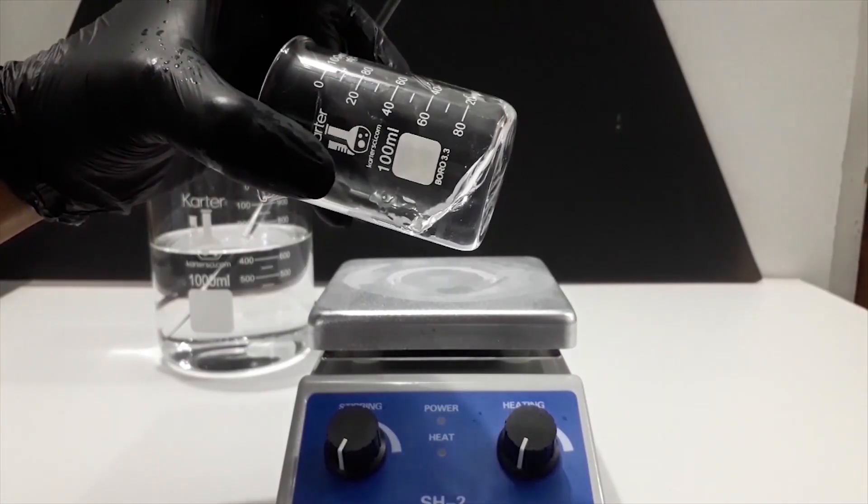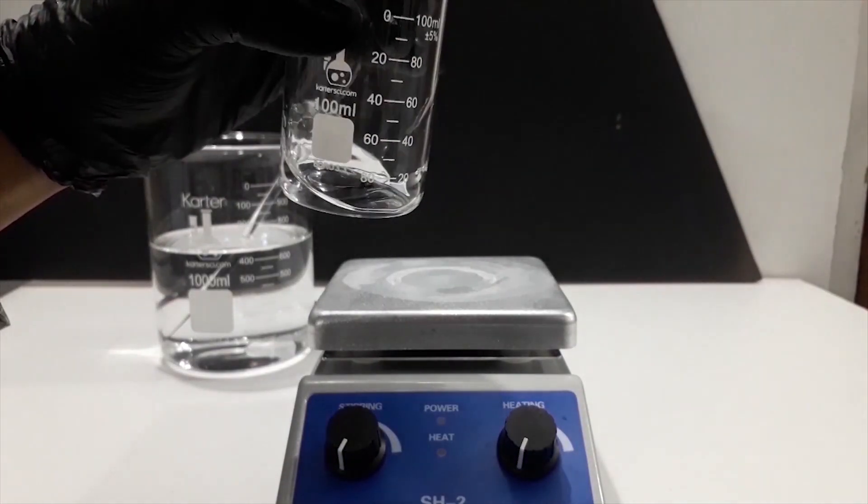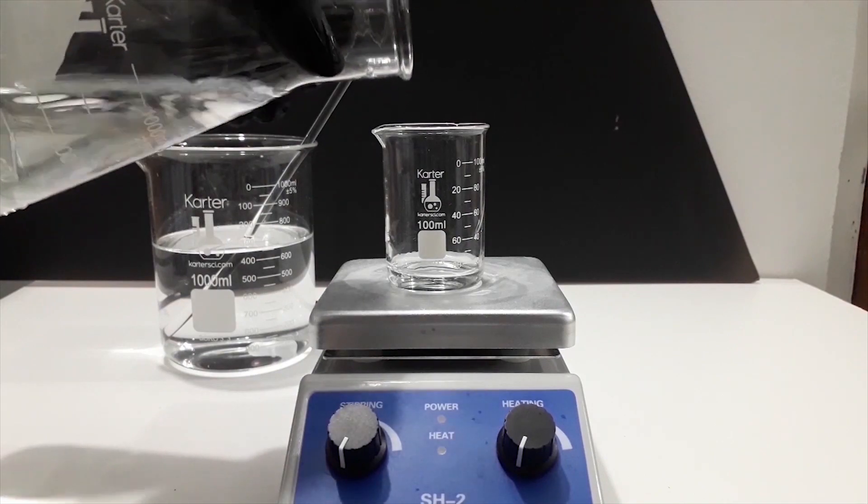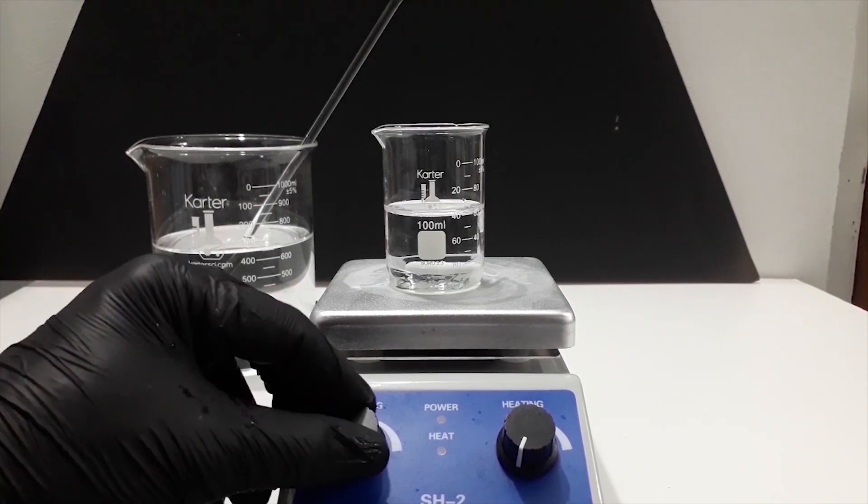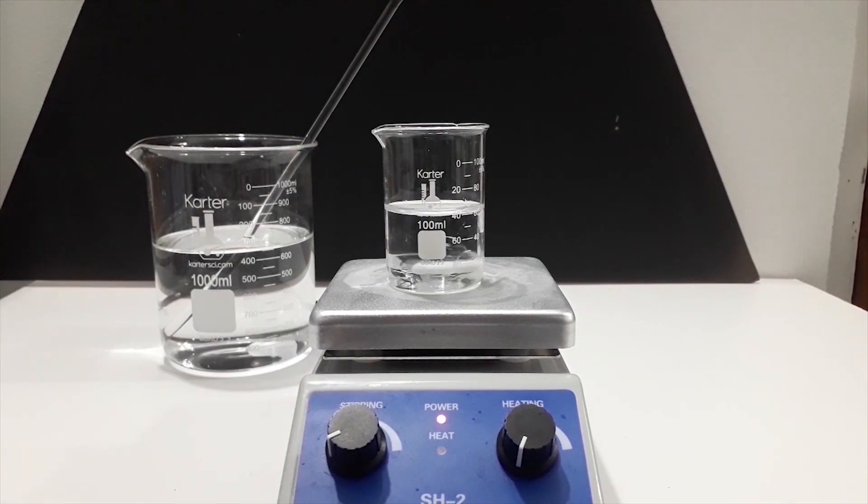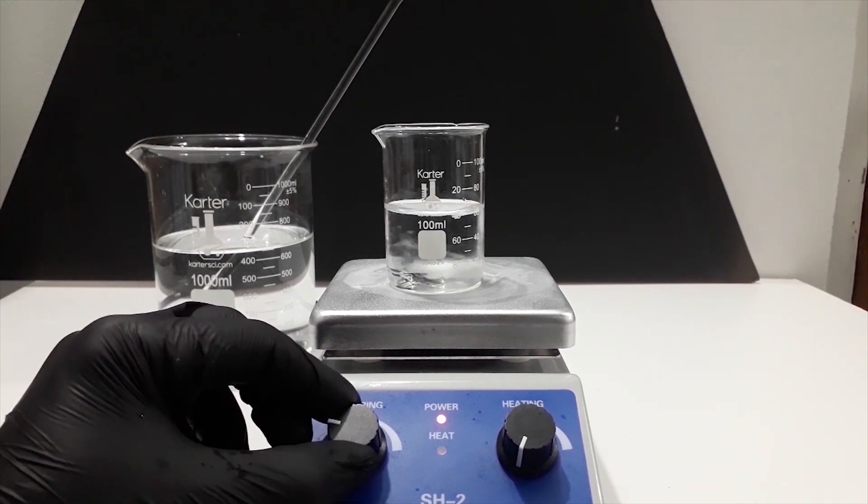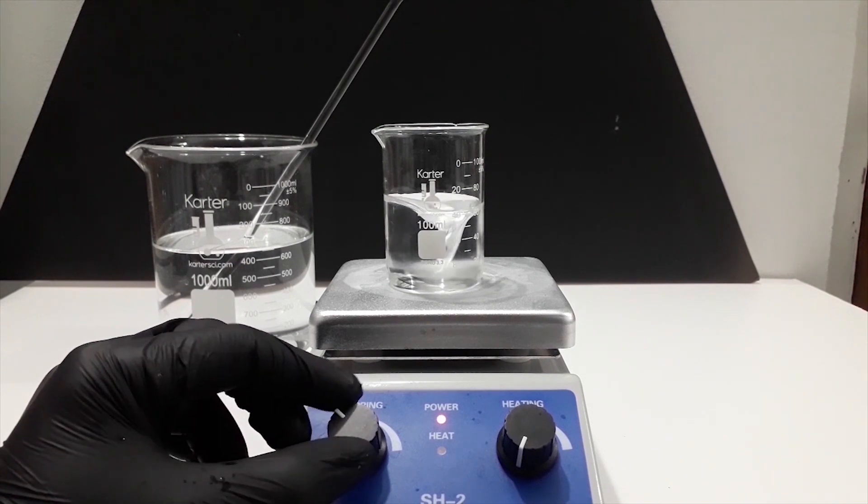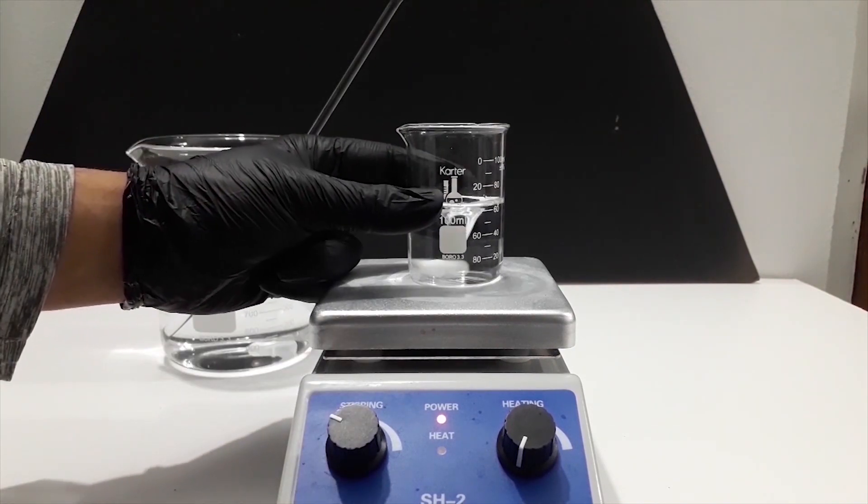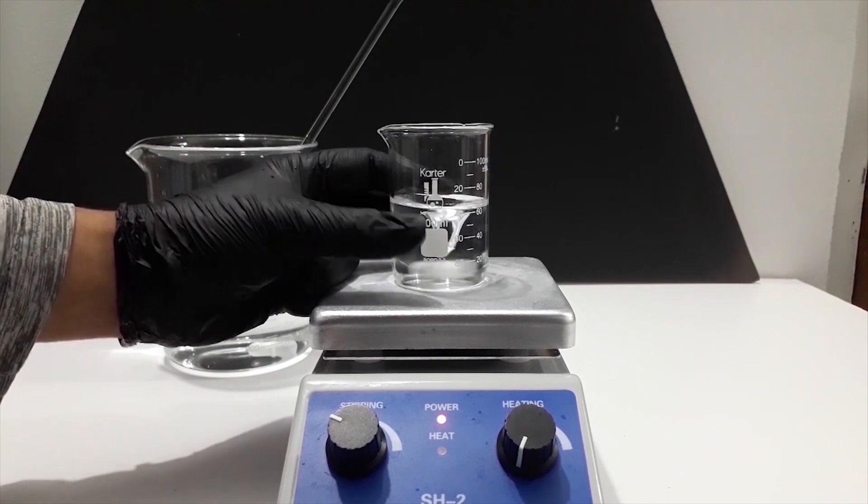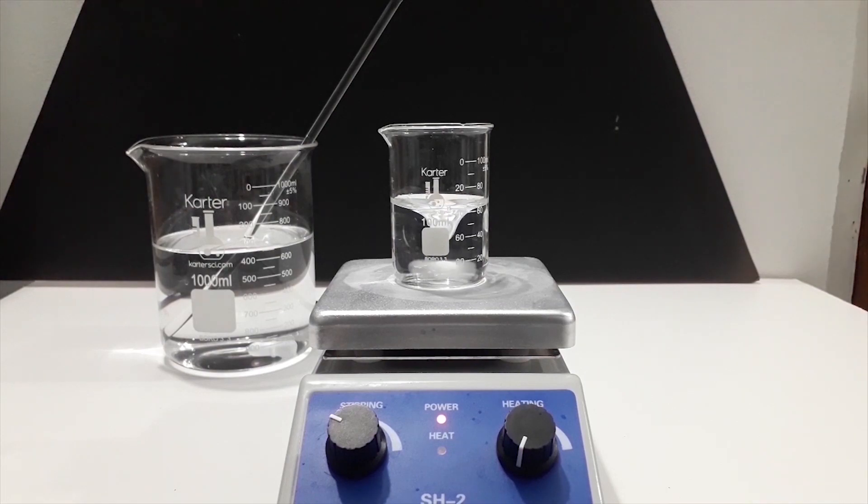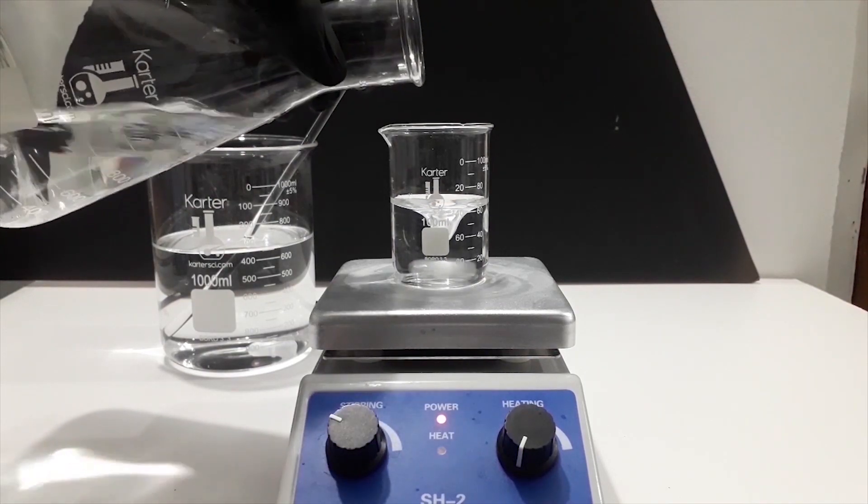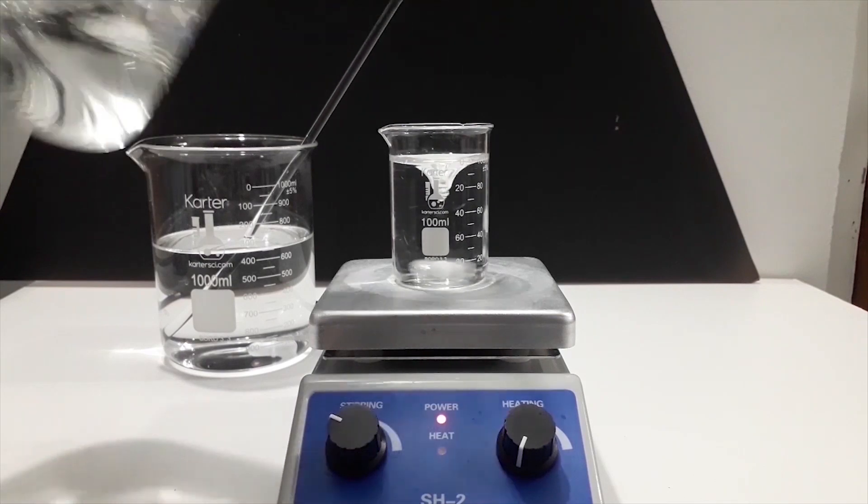Once everything is dissolved, I then weighed out 10 grams of polyquaternium 7. It came out as a viscous fluid, so we need to add water to thin this out. 50 milliliters of water was added and dropped in with a stir bar. Then I turned on the stirring to dissolve it. The beaker was then moved around a bit so the stir bar could get the rest of the goo.